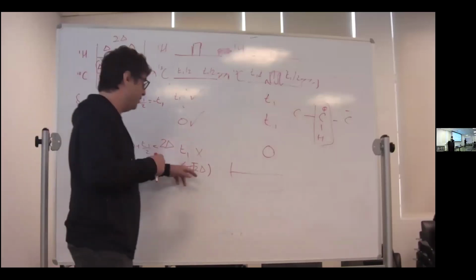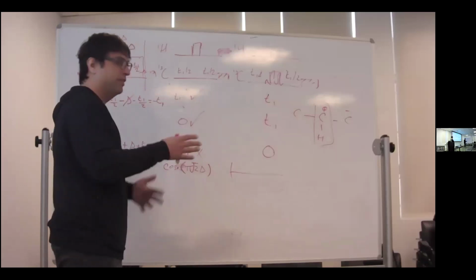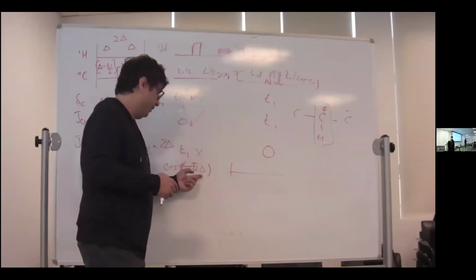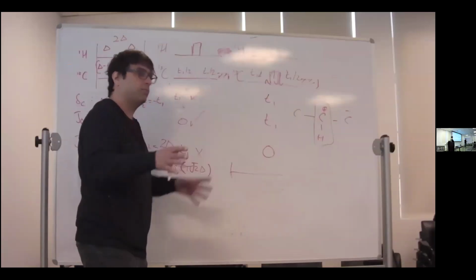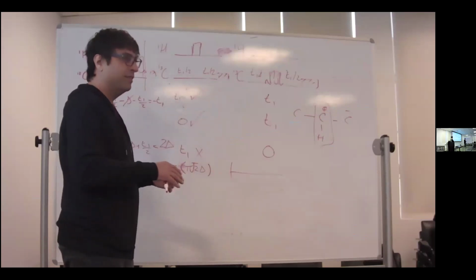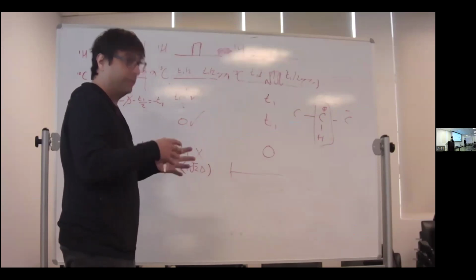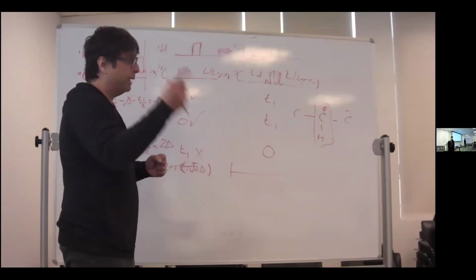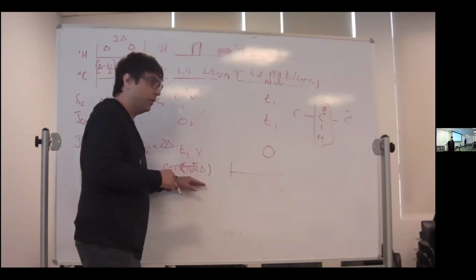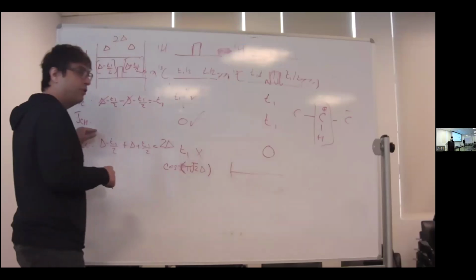So to the extent that you deviate, 55 hertz, 54 hertz, that's going to have a negligible effect on the angle that we end up with here. And that works pretty well for solution NMR. Now, if you have huge dipole coupling contributions, then the J's will be different potentially, right? Some will have a big dipole contribution, others will not. But generally speaking, this works well. So now let's go to CH couplings.